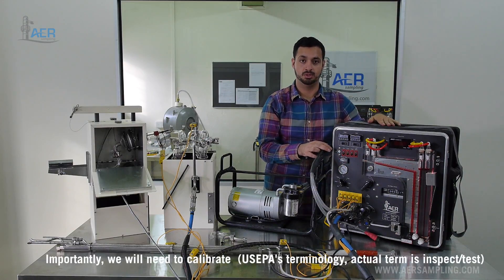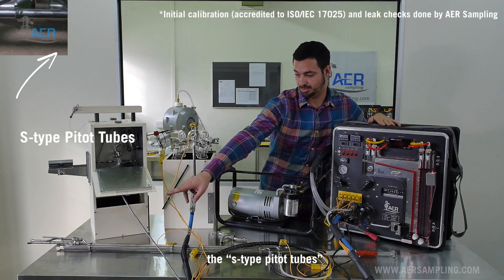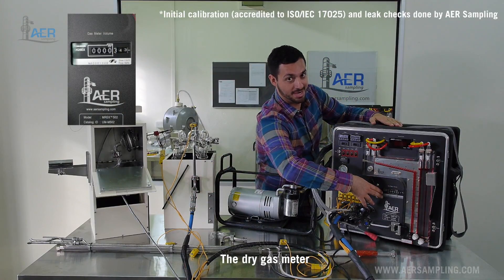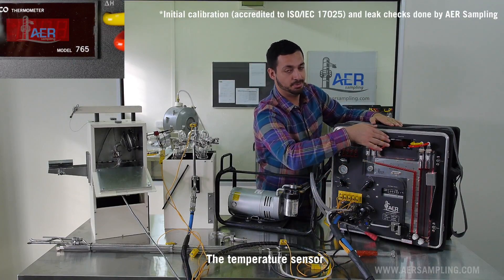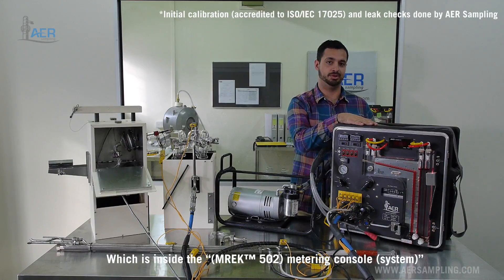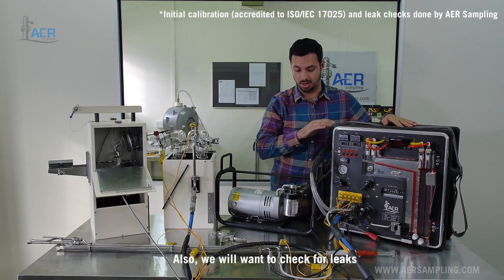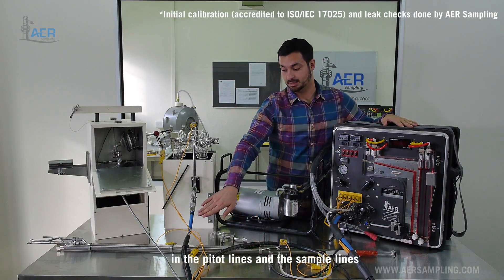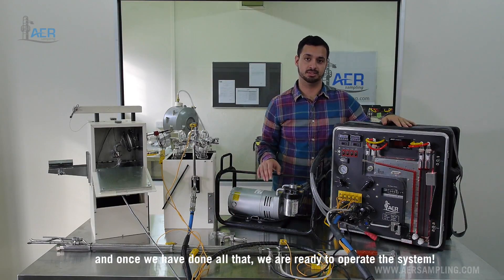Importantly, we will need to calibrate the nozzle, the S-type pitot tubes, the dry gas meter, the temperature sensor, and the orifice tube which is inside the metering console. Also, we will want to check for leaks in the pitot lines and the sample line. And once we've done all that, we're ready to operate the system.